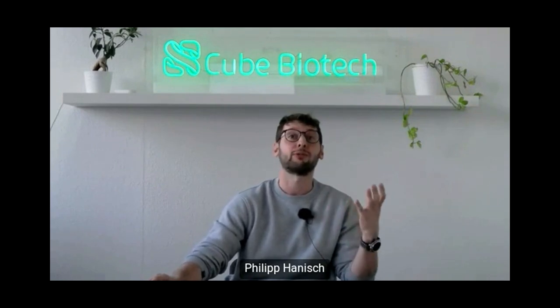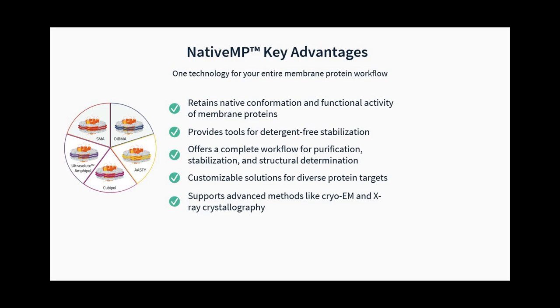And this is a huge advantage, because by retaining this native lipid environment around the hydrophobic domain of our target protein, we can really dramatically minimize protein denaturation and protein aggregation, and we can preserve this functional activity, which we are really looking for when it comes to drug screening, and of course also when it comes to structure. And this is super critical for downstream applications, not only structural studies.